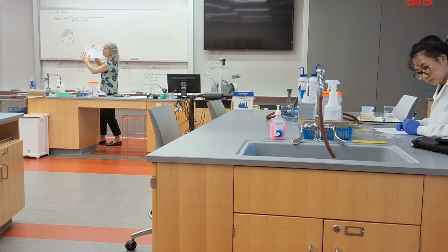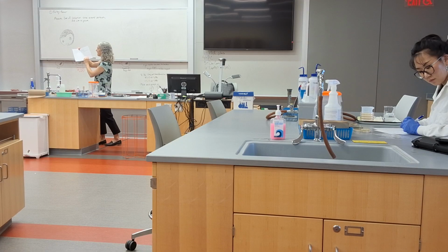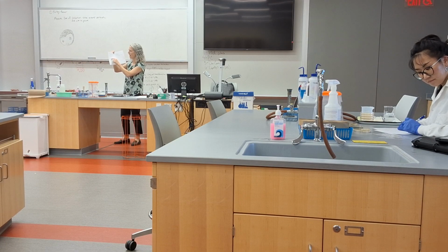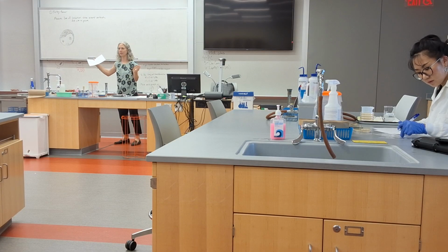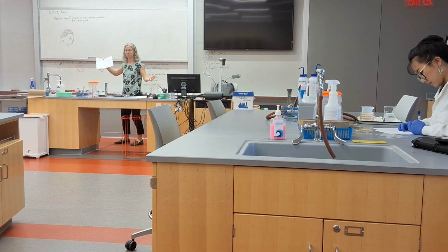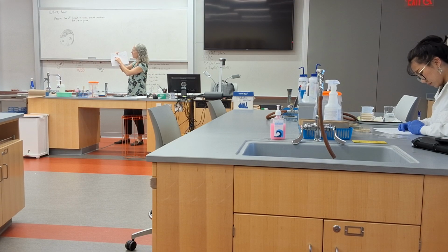When you have all of that information on the right-hand side, you're going to determine is it broad or narrow. So if you find that every species is sensitive to it, all four, then it's broad. It's affecting a whole wide range of bacteria. If you find it's only effective against gram-negative species, but not gram-positive, or vice versa, then that's narrow.